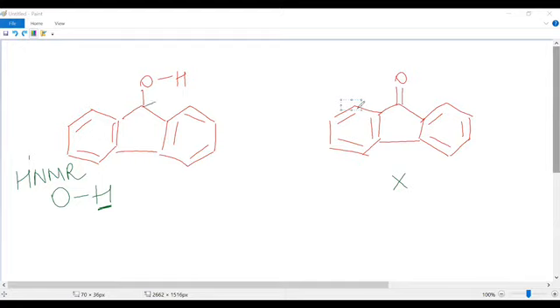You will also see this sp3 carbon hydrogen peak as a singlet. Of course, this is also a singlet. This hydrogen will also be a singlet, no neighbors around it. That peak would also be absent in the proton NMR of your product.